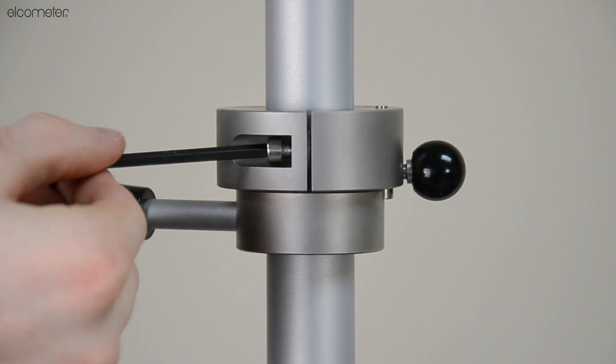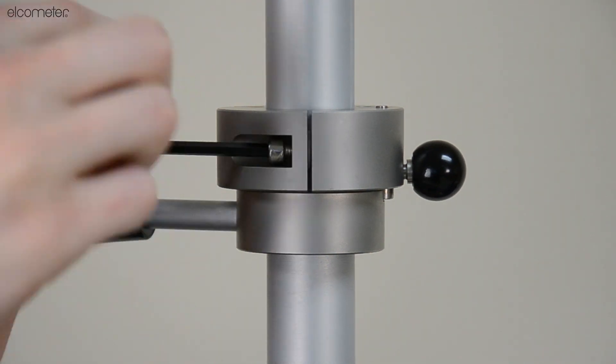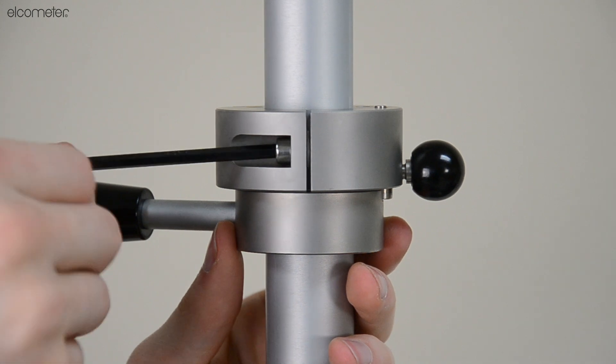Slide the release collar to your required position on the graduated tube and lock it into position by tightening the fixing screws.